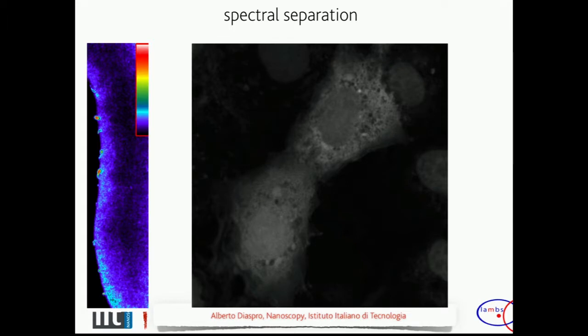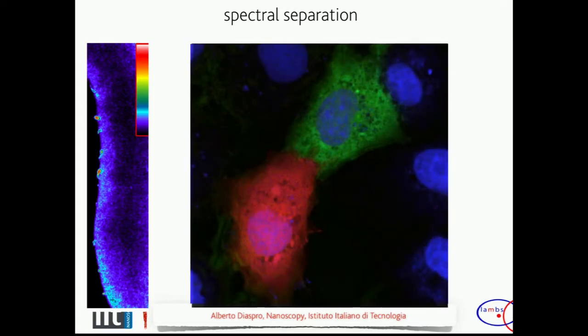You can say something related to, even if it's poor, the contrast here about intensity distribution, so it can tell you something. But maybe this information is better if you're able to produce this without artifacts and in an appropriate way, because this tells you not only something about morphology, but about specificity of the molecule, and in some cases about their function in the sample.